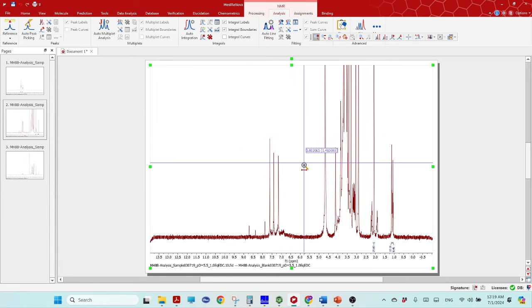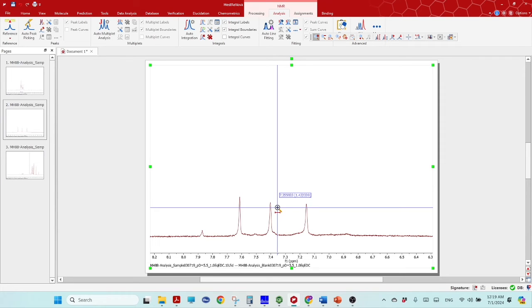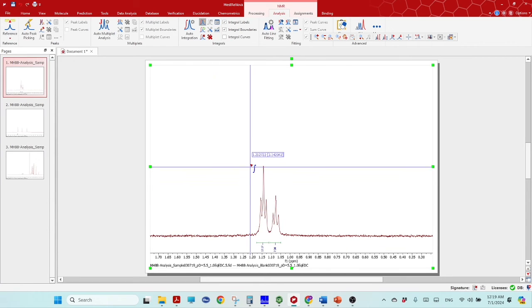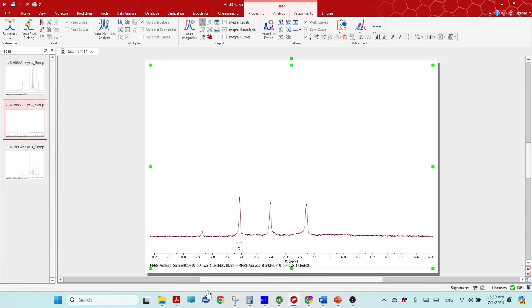Now let's see our acid concentration, like dicarboxylic acid. So if we do this peak integration again, although it has something around it, but still we can get some close value. So now it is showing 7 millimolar, but previous one, if you remember, it was showing like 10. Oh, actually not 7 millimolar, so 10, and we got 15 because whatever the value we are getting here, these are 2 protons, so then it was more like 10 and it was like 7.